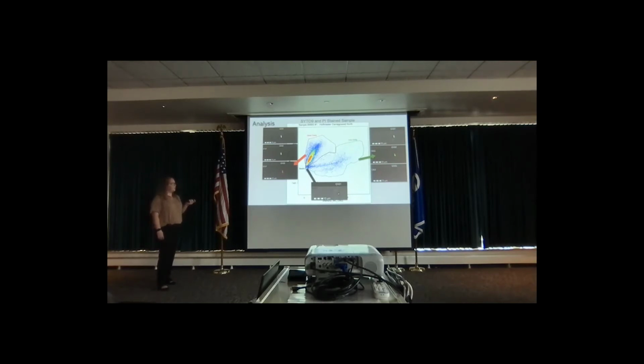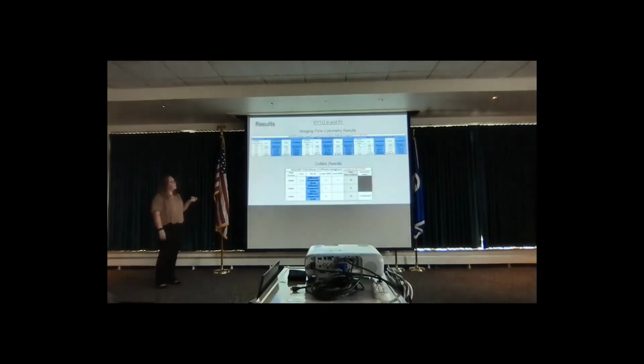And then that smaller region, by looking at each individual picture in that area, I could tell that this was a bead because it is smaller. And the beads are just something that run in the background and help with analysis, because they can be next to another cell and just tell you what the size is by looking at it.